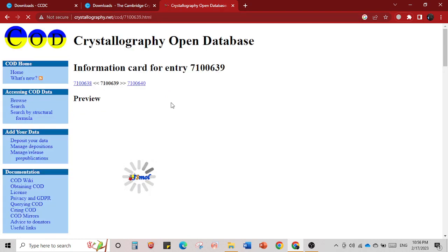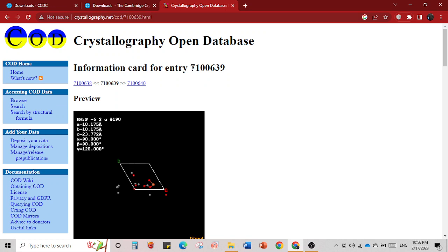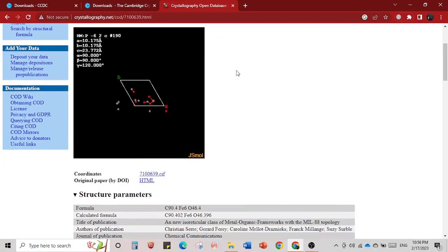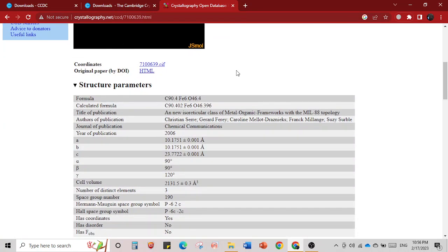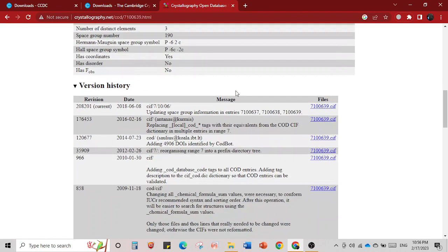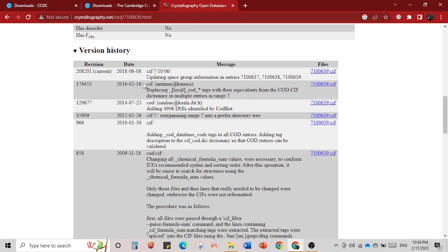When you enter the search you get a list of information. The CIF entry for MIL-88B has a card number — this is a unique number for each crystal structure deposited in the database. This is called the card number for the crystal database. It is an open database where anyone can download it. You can see a lot of references, including when it was revised.